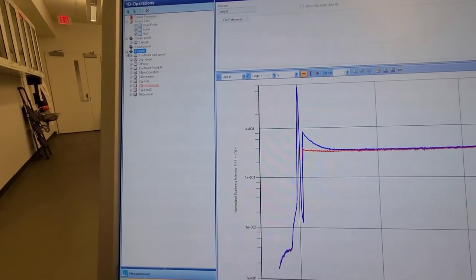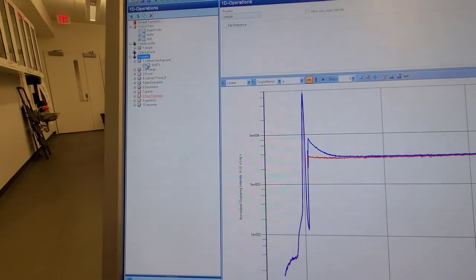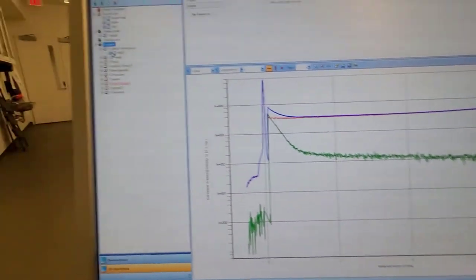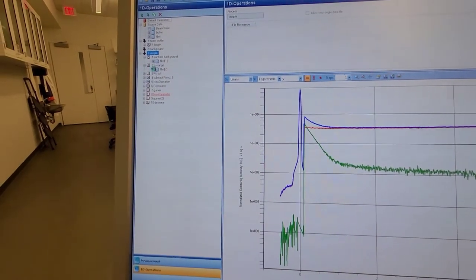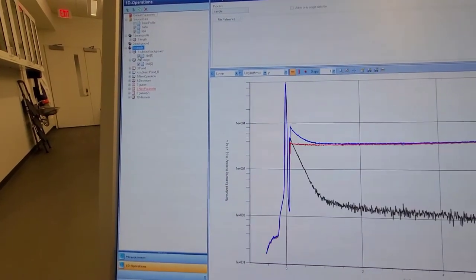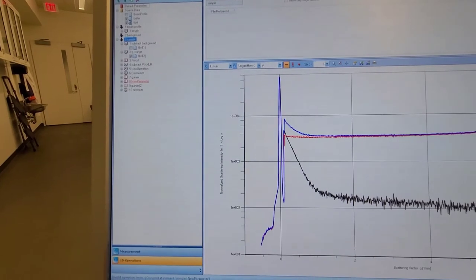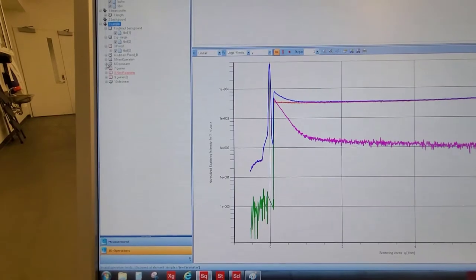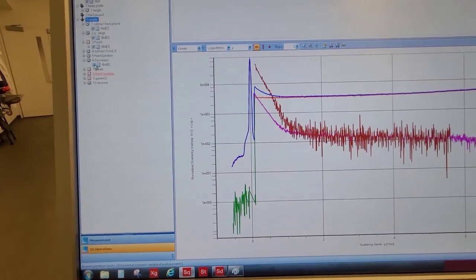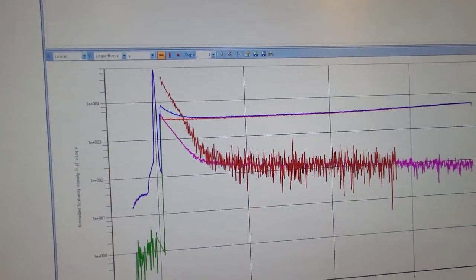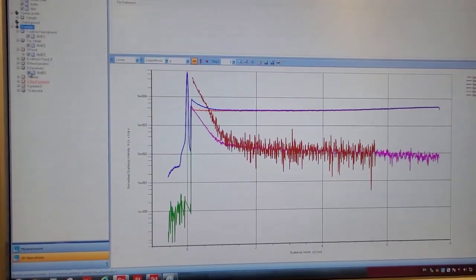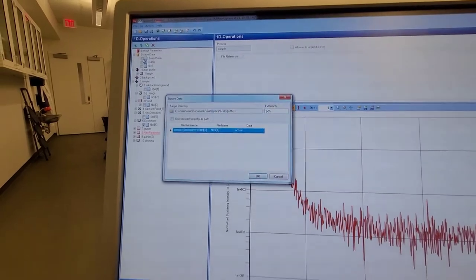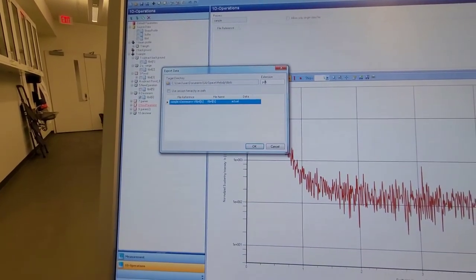Once you do that, when you do the subtraction, it also calculates it for you. So it subtracts the buffer from the sample. The black line, the black profile that you see is the subtraction. You can also do a Porod subtraction. That should be in there and de-smeared, which is crucial for line collimation. This red spectra is the de-smeared one.